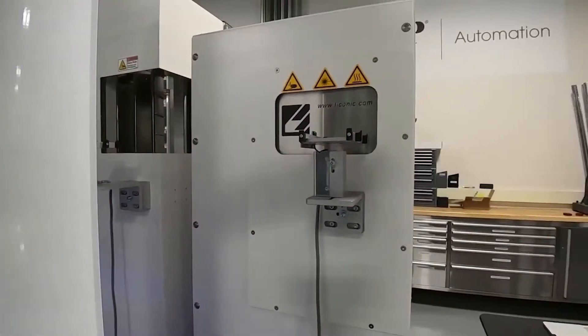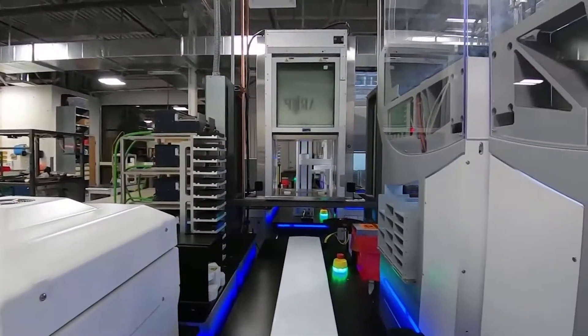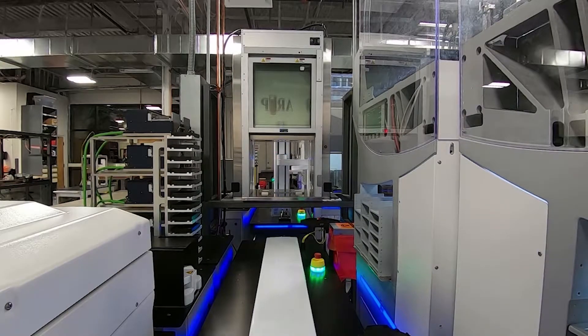All they make is automated centrifuges. Then we have another four-degree and ambient stacker. This line actually looks pretty long — and it is — it goes across two different rooms, but that's necessary for the amount of testing and the different complexity of testing that we have.